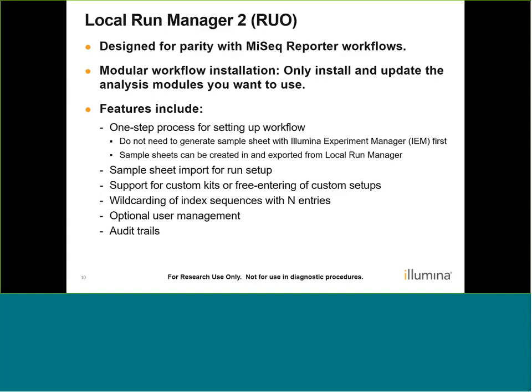There is a sample sheet import option, so you can import sample sheets that you already have, although we'll discuss a couple caveats with that later. There is support for custom kits or free entering of custom setups. This free entering of custom setups also allows you to enter Ns into your index sequences to use as wildcards to stand for any base. There are optional user management selections, which we'll discuss, as well as audit trails, which are useful for operating in a more regulated environment.